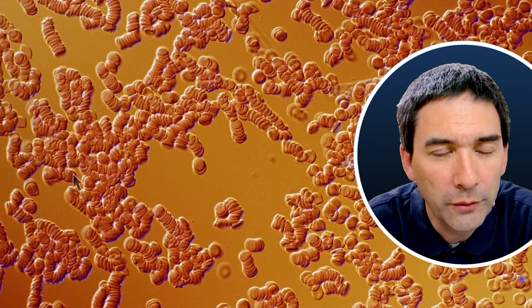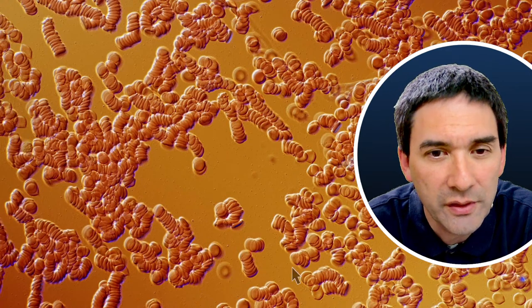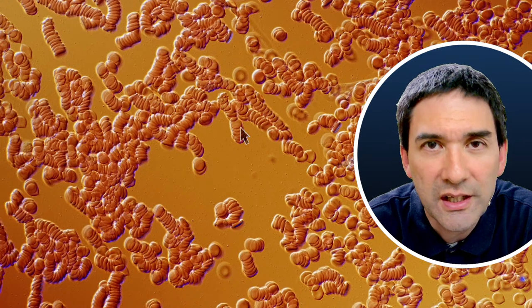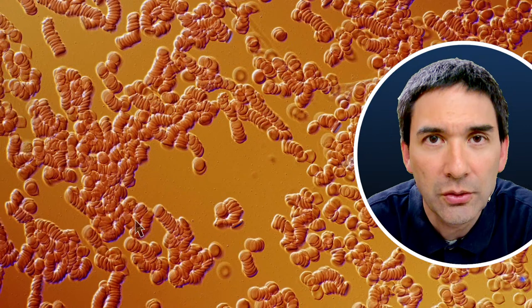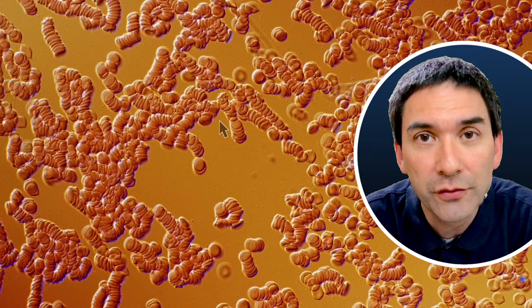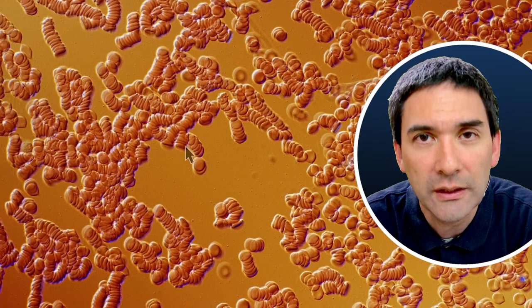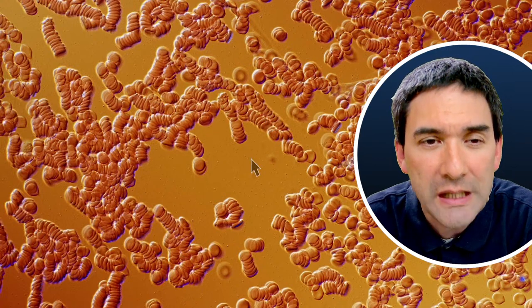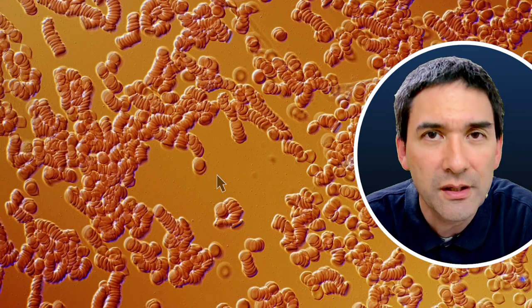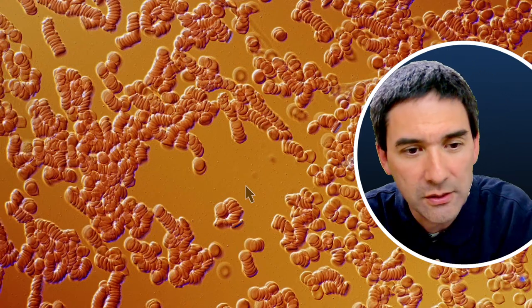It's a completely normal phenomenon that you see when blood starts to coagulate. So this slide is already starting to dry up, and the blood cells start to stick together, and in a different part of the slide you're going to see that this does not happen. Whether this happens or not also depends a little bit on the thickness of the blood layer, because if there is not enough space between the cover glass and the slide, then the red blood cells are not able to stack up like this, and they're pressed flat. But this is a totally normal thing that happens when blood starts to dry.